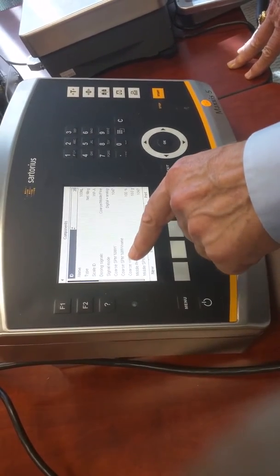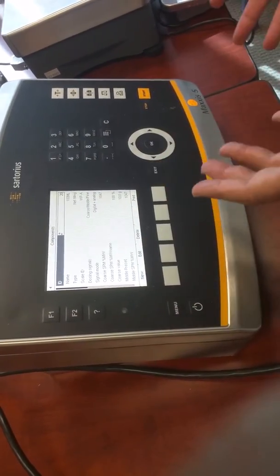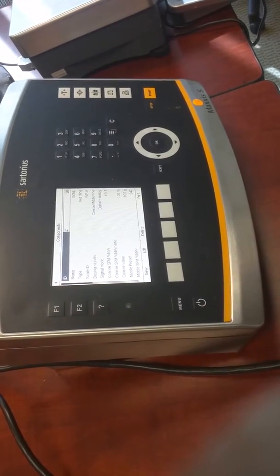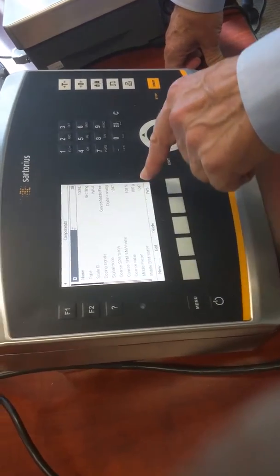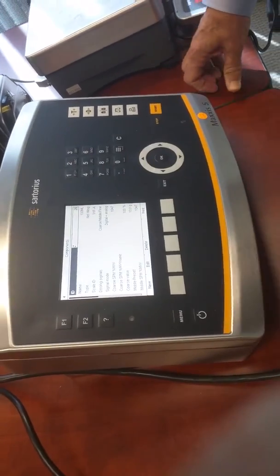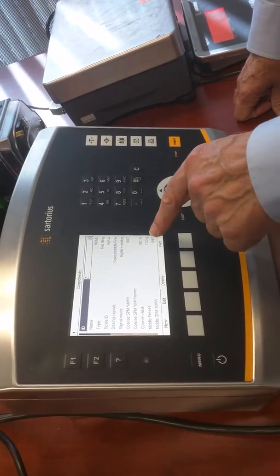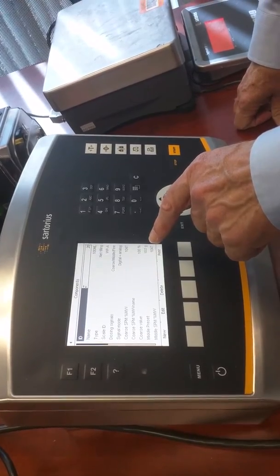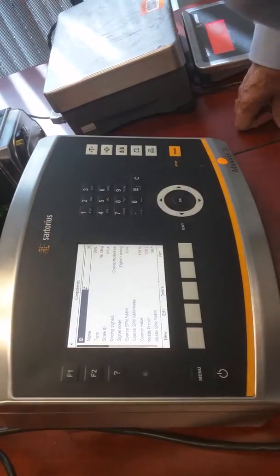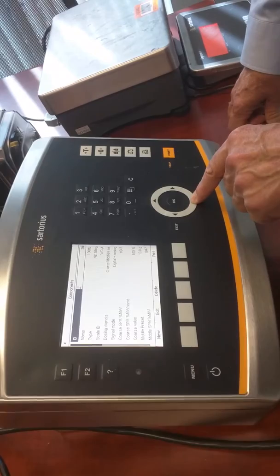All right, you'll notice it says coarse, 100%. So we could also make coarse 50% or 99%. But basically when you start out, it's going to run at 100% until we tell it to do something different. Now, the middle set is 10 grams before the 100 mil fill is finished, because that's what we've got set, 100 mils. So it's going to go to the middle setting 10 mils before whatever you've got set, and then let's go find out what that is by going down.